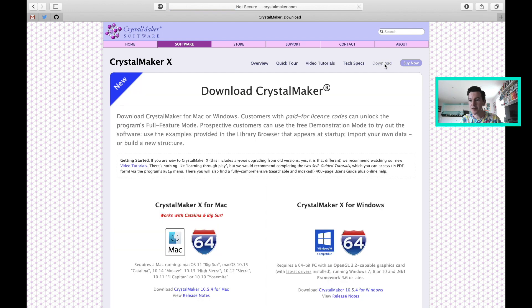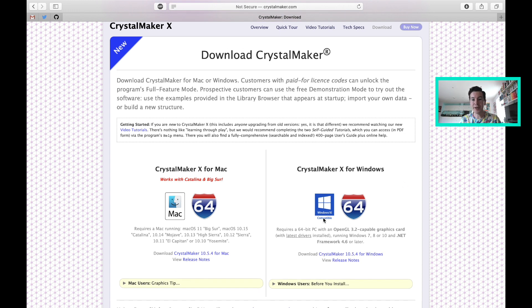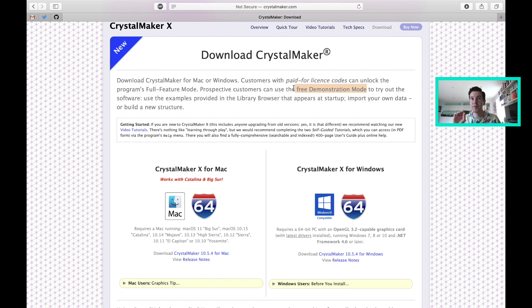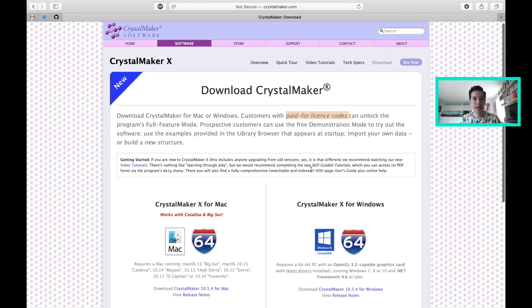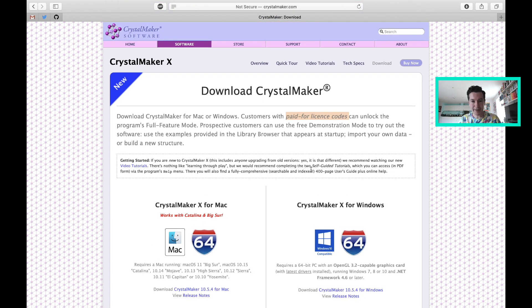For today, we just want to go to download. You have a choice to download a version for Windows or for Mac. When you first open it, it will prompt you to enter a license code — I should have given you a license code at the end of my first lecture. If not, you can still open the package, but it runs in demonstration mode, so you're limited to some functionality and it'll probably have a watermark. When you do have access to the license code, it's best to put it in. I've already installed the package, so I'm going to click on it in my toolbar.